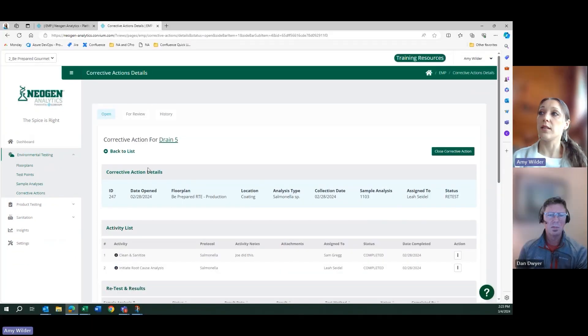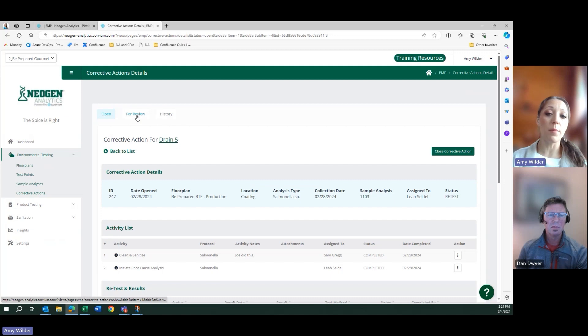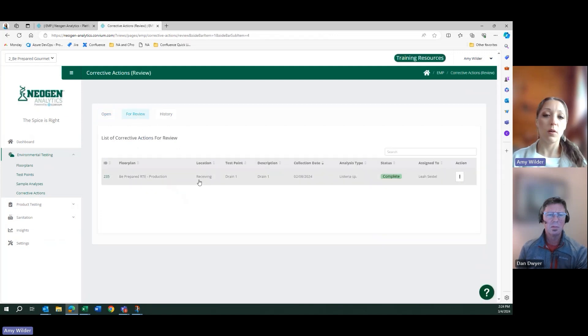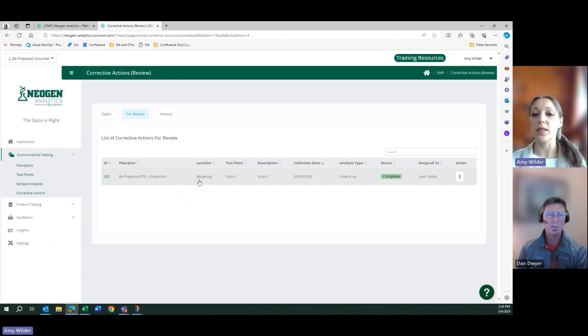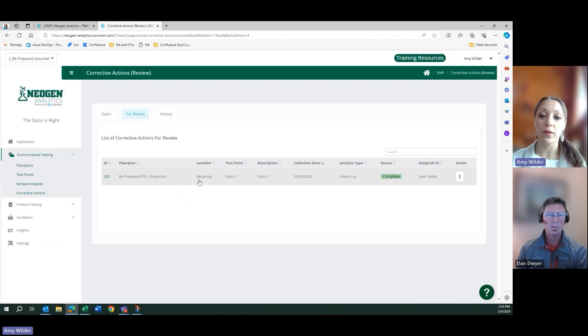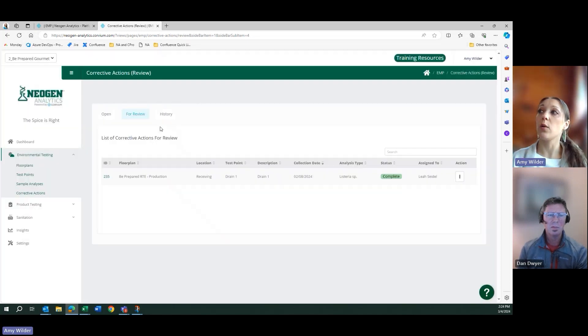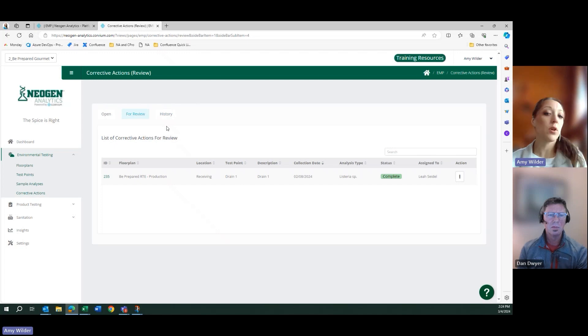Once this is deemed complete, the software would automatically push it into this for review stage for someone to review the activities, the notes, attachments, things like that, and sign off. They could verify that this was complete, mark it complete. And once they do that, it would then move over into the historical section.